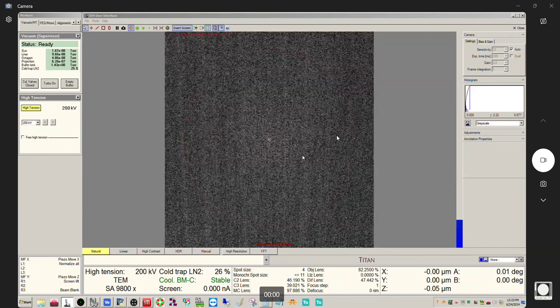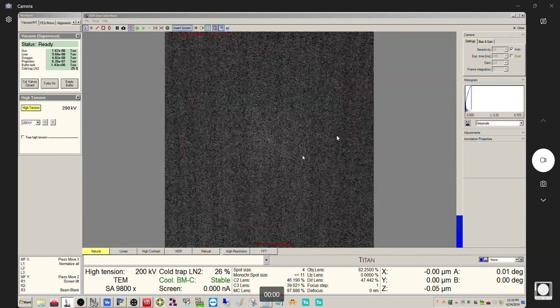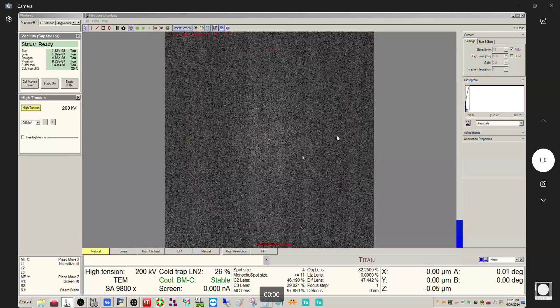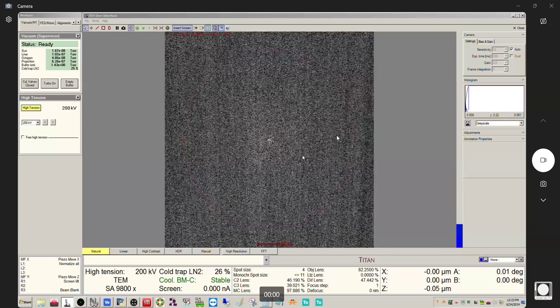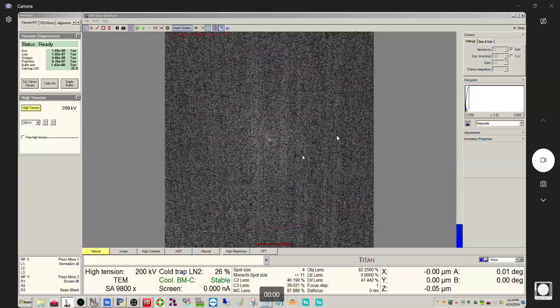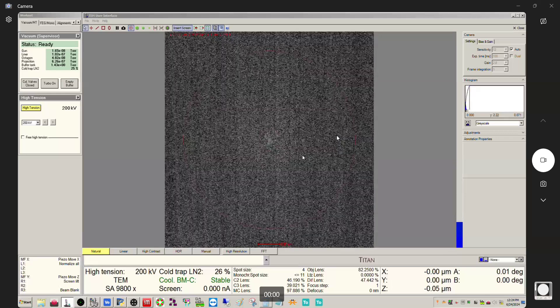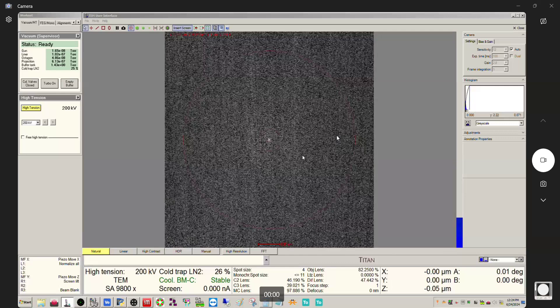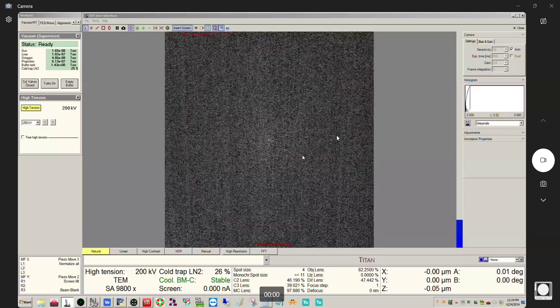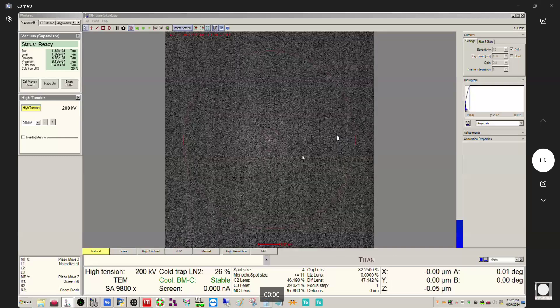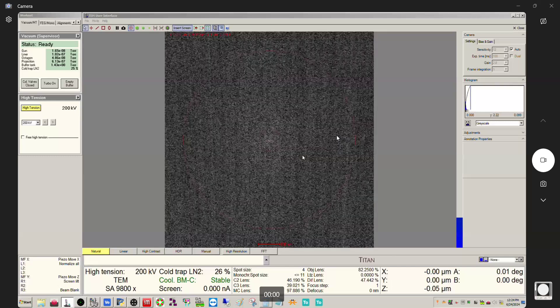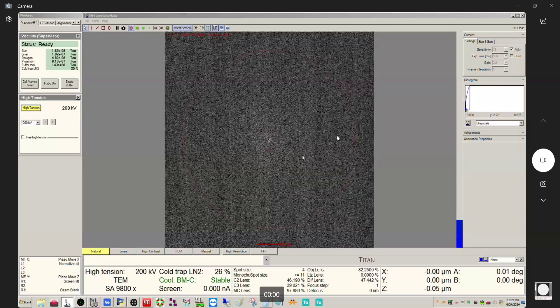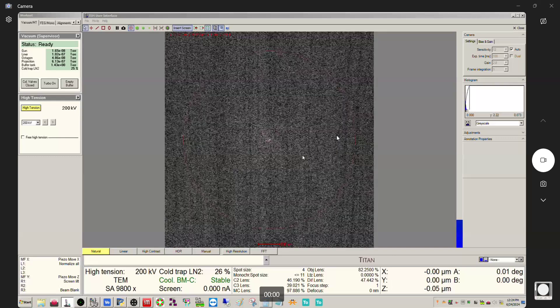You don't have a beam. Thankfully there's a pretty short list of reasons why you're not seeing anything on your screen. The most obvious reason is you have something non-transmissive to the beam that is in the beam path. We're using an omniprobe grid here, so if we're over part of the grid — that's 30 microns thick of molybdenum — we're obviously not going to transmit through that. Same if you're working with a support film grid and you're over the thick copper, which is several tens of micrometers thick.